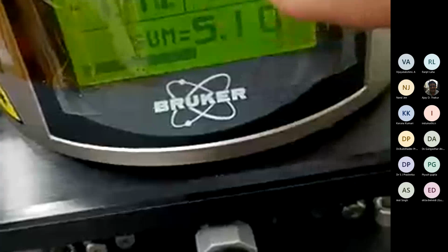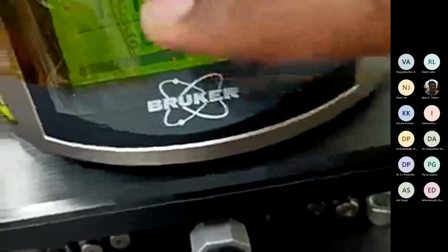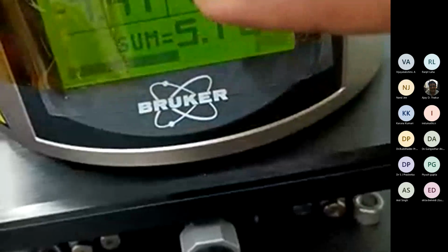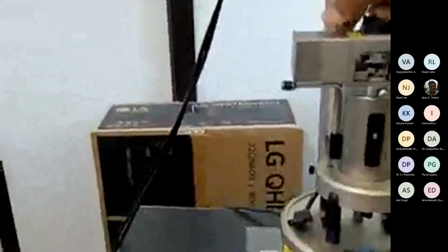And this horizontal is nothing but the friction quantity. So before starting this scanning, we have to keep the sum at maximum, and vertical and horizontal should be close to 0. So we have aligned the laser. We are going to align the photo detector now.